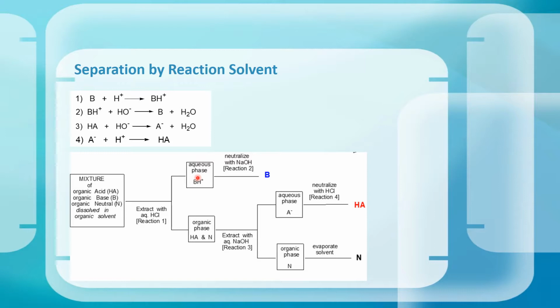Because oftentimes what's happening is you don't have any that's been deprotonated yet. Particularly like with benzoic acid, you're trying to get the proton off of the carboxylic acid group. So by adding the sodium bicarb that we add in that experiment, you're actually turning it into a water-soluble salt, and it's going into the aqueous phase.